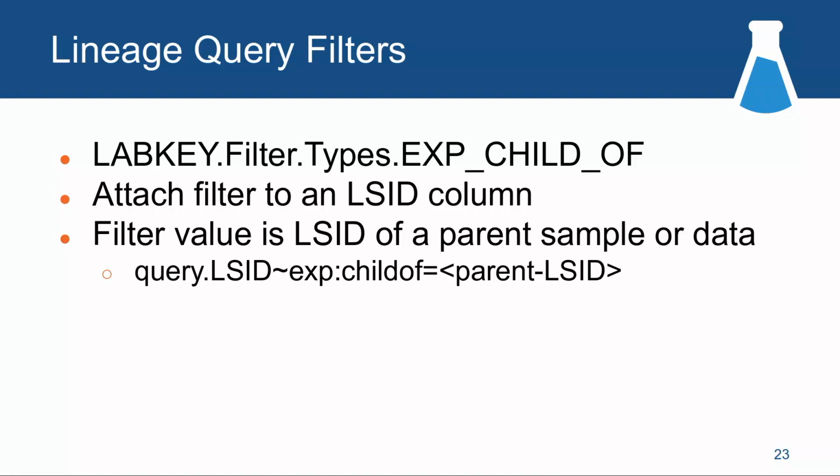So I'm interested in all the children of this parent, right? That's the fun thing we can do here. And then we also have the equivalent in the opposite direction. We have a parent of as well.